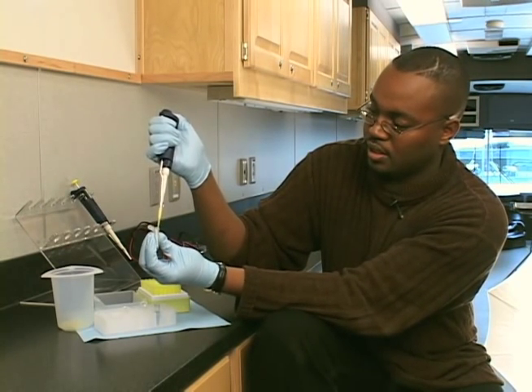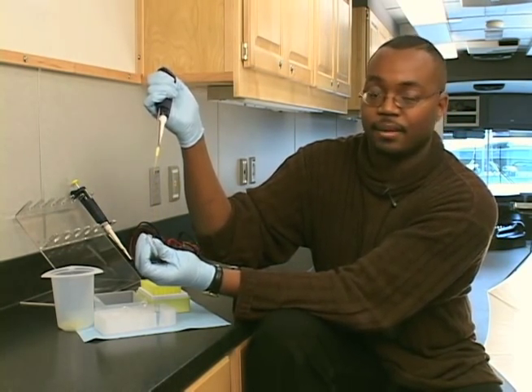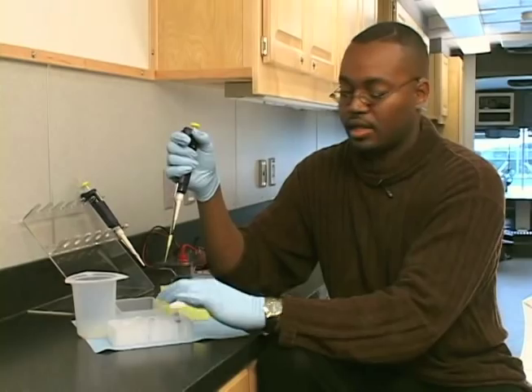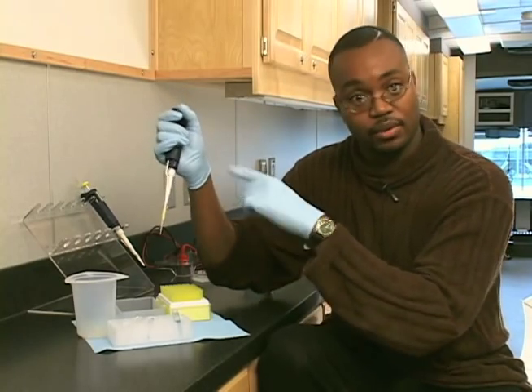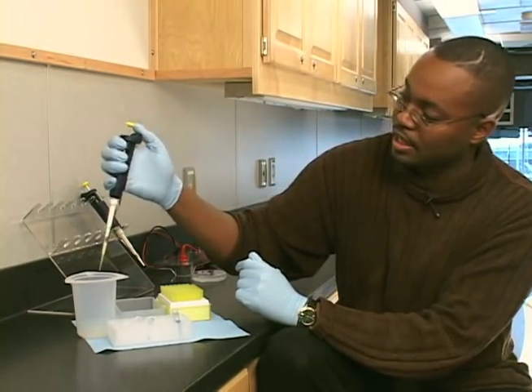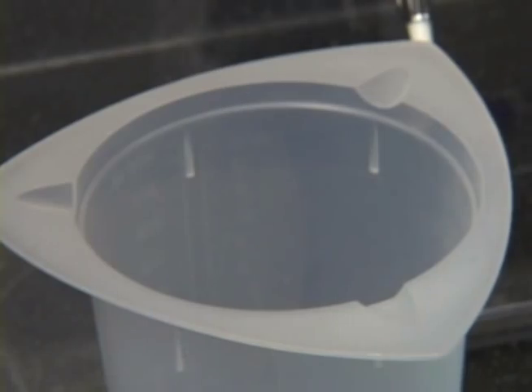As you can see, my pipette tip is empty. My micro tube has liquid — 20 microliters. And now, to get rid of my pipette tip, because I want to use a different pipette tip later, I eject. I just push the eject button, and that pushes the pipette tip off.